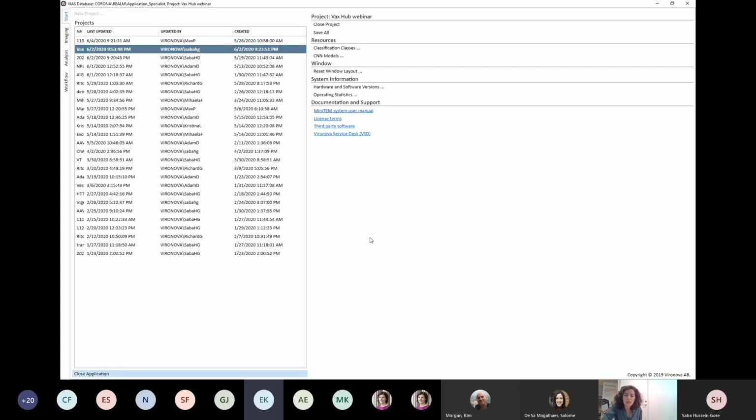Thank you. Is it possible to make this screen larger? This screen? Yeah, is it possible? If not, no problem. But if it is, it would make it clearer for me because I can't see very well. But that's because of the way I'm running the actual Teams.